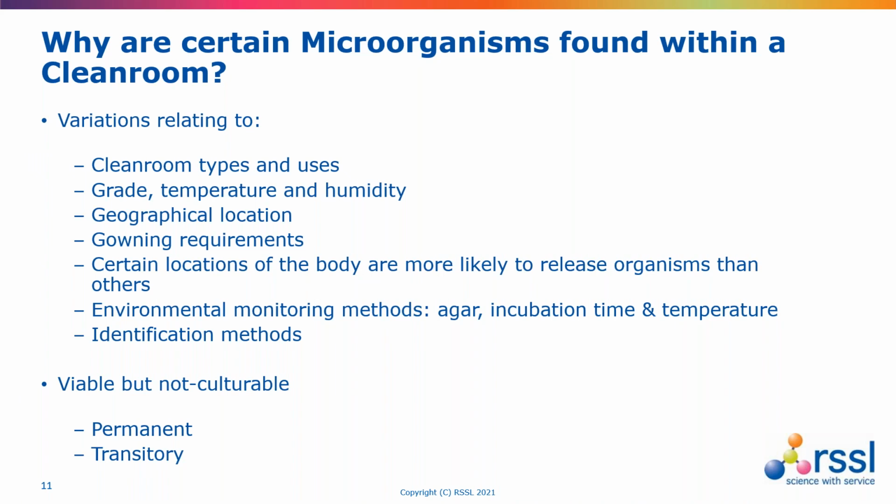So now to why we might find certain microorganisms within clean rooms. Although clean rooms are well-controlled environments, and we might have good control over our incoming materials and lots of other control measures in place, we will still get a level of spores occurring.